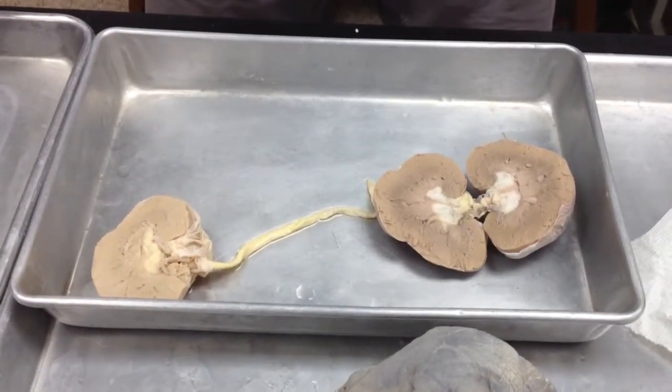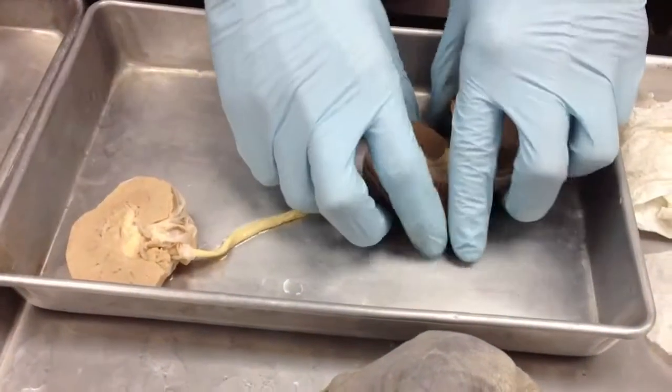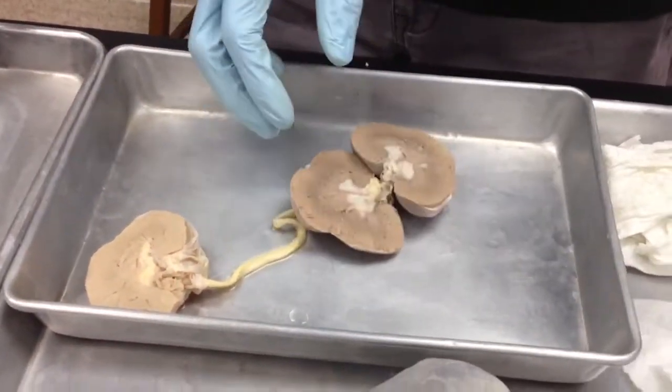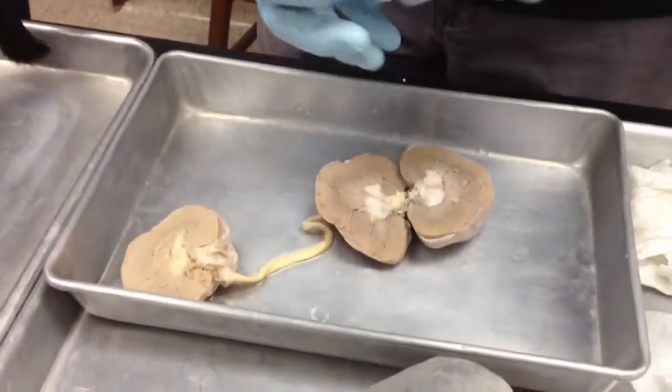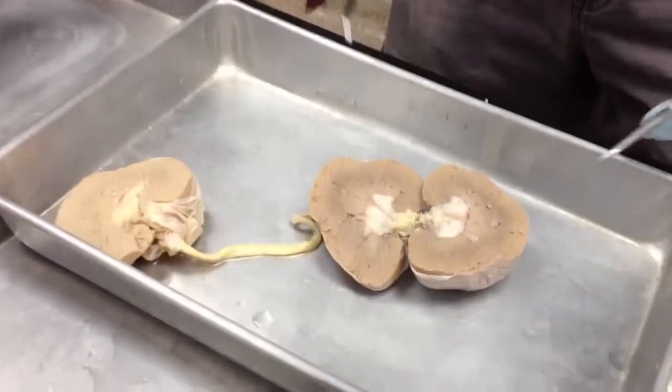There's not a whole lot for identification. There is more than just identifying it, but as far as identification goes, hopefully these two probes will help you. So there's three main sections of it.